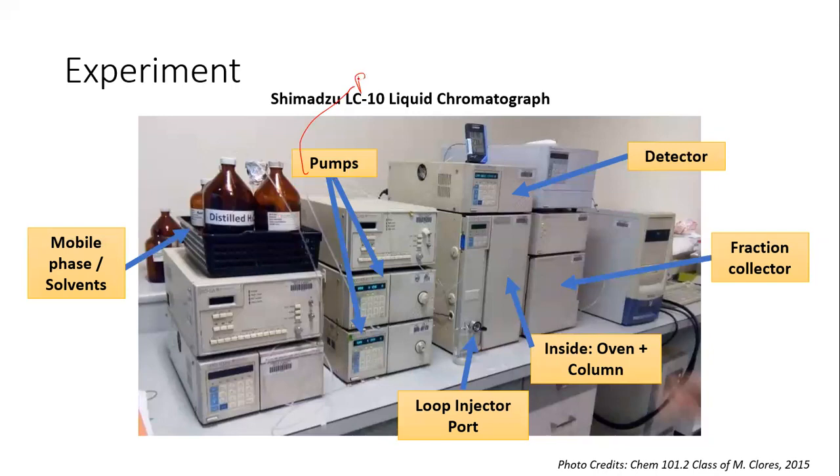Okay, so before you perform your analysis, pinipurge muna yung column. Okay, so pine-prepare siya para matanggal yung mga impurities, pati yung mga compounds, mga analytes na naipon doon sa previous analysis or previous na paggamit ng HPLC. Okay, so medyo matagal yung pag-purge na yun.